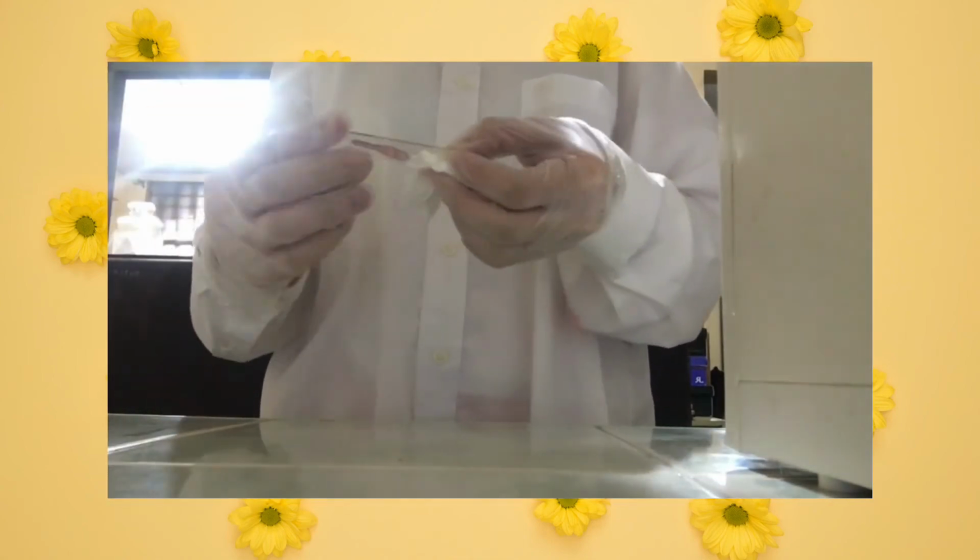After finishing all the steps, wipe the edges and the back of the slides to clean it. Note to take extra care not to touch the sections.